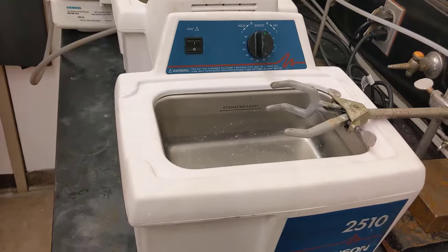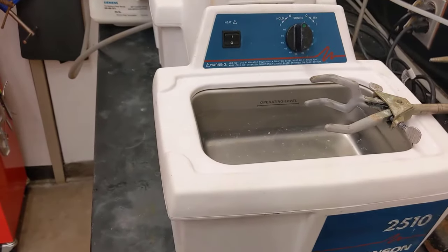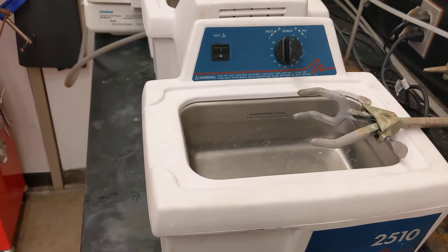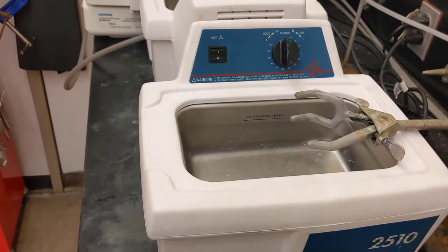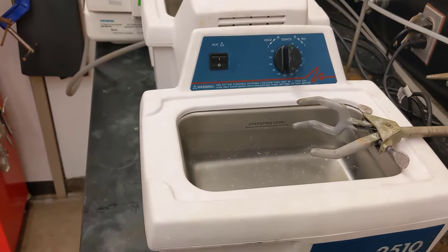This is a quick video tutorial on how to use the ultrasonic baths in the lab. There are a couple of them here. 99% of the time, you're going to use these for cleaning surfaces of different materials, especially if you're involved in a project that works on fabrication of microchips or sensors.